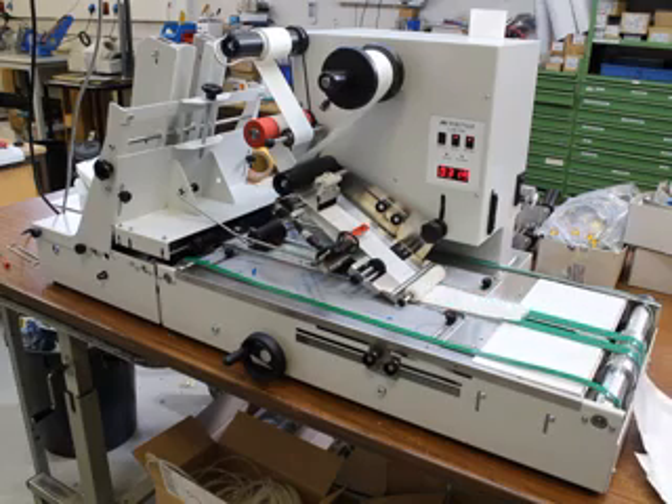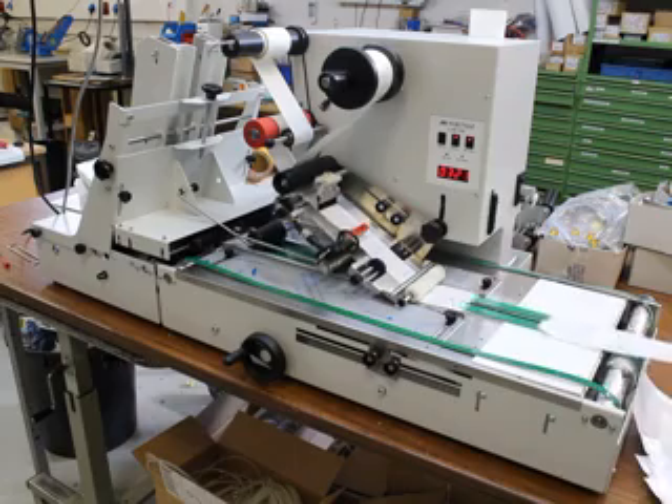The machine, as you can see, is a small compact desktop machine which can fit on every desk.